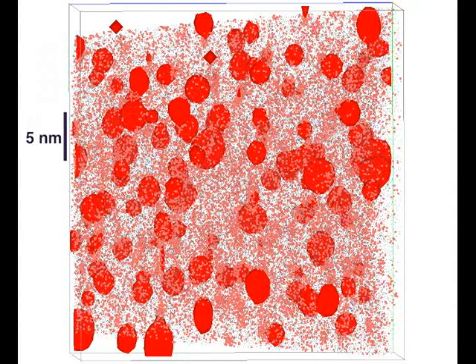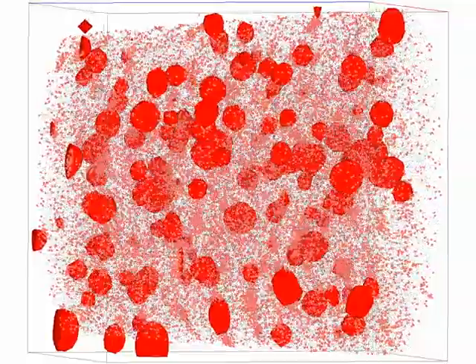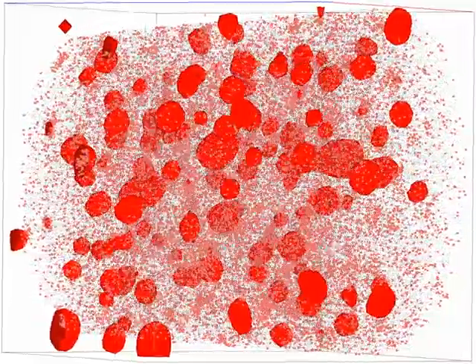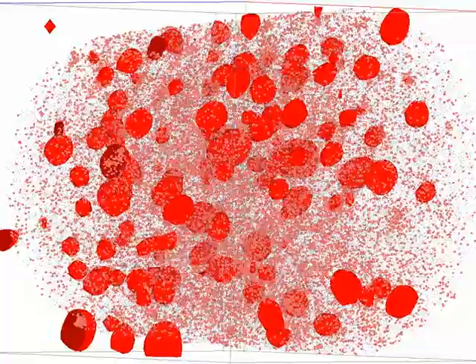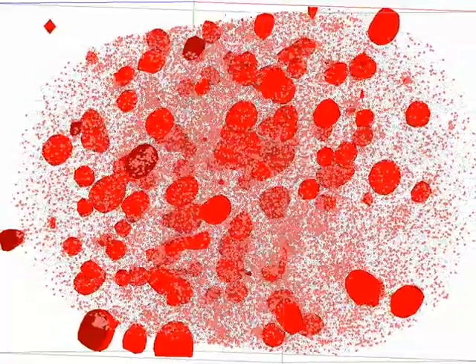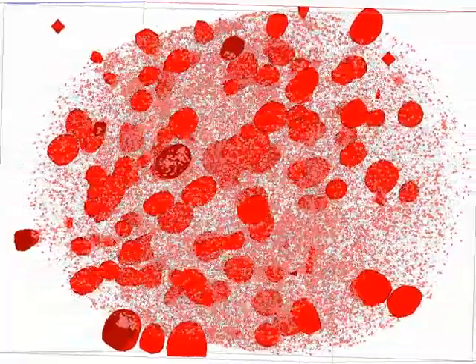And the bar there shows 5 nanometers as the largest cluster. We do a rotation around. You can see that here coming to the front, the darker areas is where one of those surfaces intersects the edge of the sample.